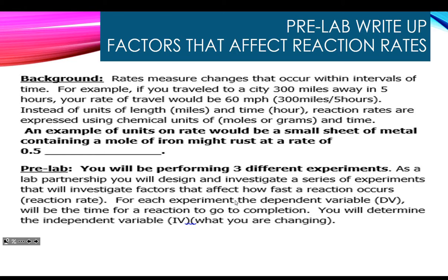So when you get to part E, you are going to test temperature, particle size, and concentration. And you're going to have 3 experiments that you get to choose how you're going to test those. But one needs to test for temperature, one for particle size, and one for concentration. I'm going to show you those today, but we're going to go through them first on the board. And as we go through them, you need to talk to your partner, whoever it is, and decide how you're going to test them. Okay, all these tests that we do in lab are going to need 2 people, one that's mixing and one that's timing.